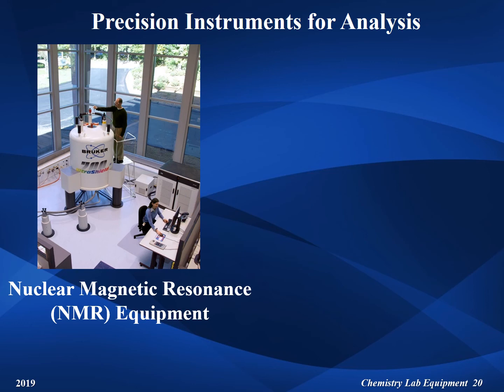While the sample is rotating, a wave of electromagnetic energy is applied to the sample. The changes in the shifts of the wave's frequency is measured and analyzed using the computer equipment shown on the right side of the photo. The graphical readout provides information used to determine the structure of the compound.